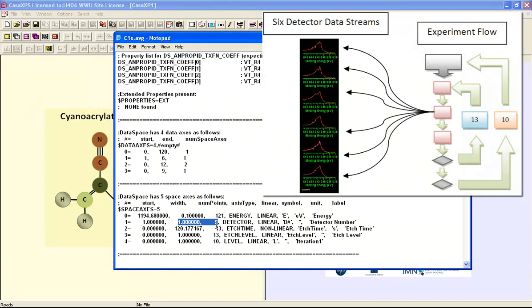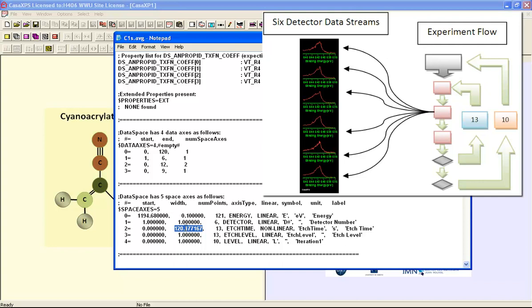Then after a measurement of these six different spectra, the ion gun etches the sample for a period of time and then a new measurement is performed. And this is performed 13 times. So this would represent a typical depth profile.